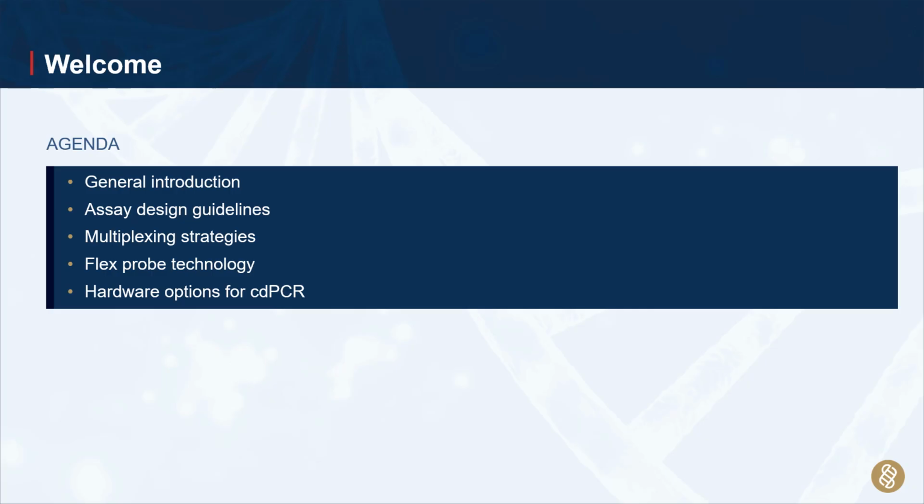Let's take a look at the agenda for the presentation. We'll start off with a general introduction into Crystal Digital PCR. Then we'll follow on to assay guidelines and the design of assays for Crystal Digital PCR, followed by multiplexing strategies one can consider when using Crystal Digital PCR, then the Flex probe technology developed by Stilla Technologies, followed lastly by the hardware options available from Stilla Technologies for Crystal Digital PCR applications.